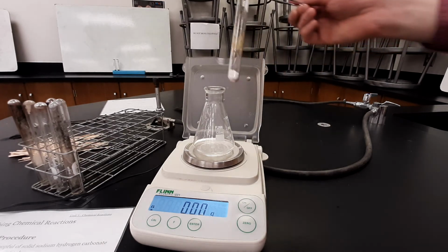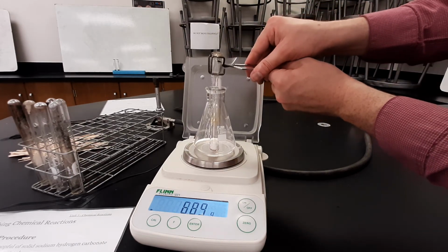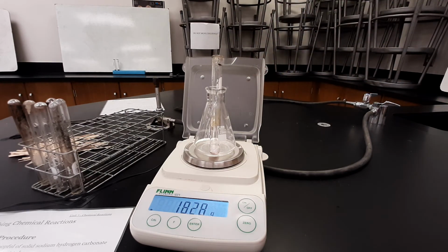Let's see if the mass has changed. I'm placing this back on the balance, removing the tongs. The mass after heating is 18.28 grams.